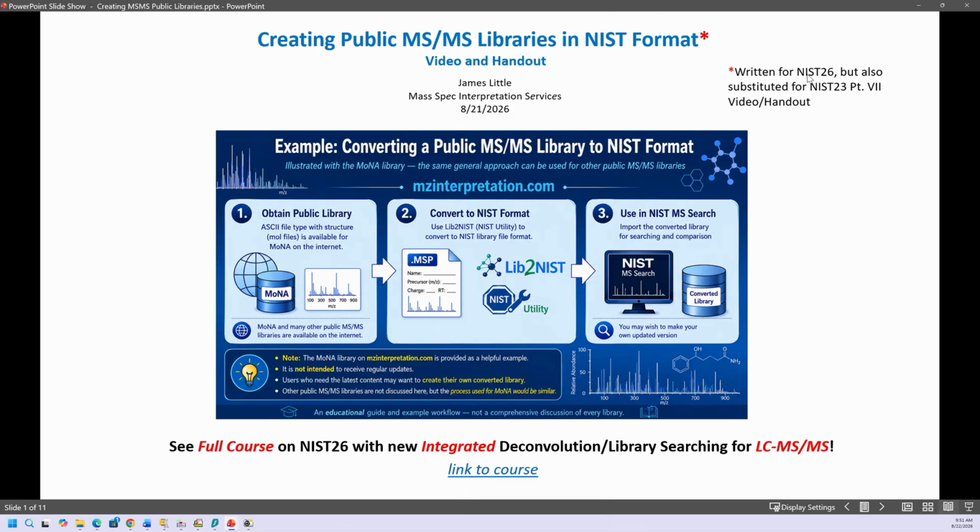This was written for NIST 26, but I will also be substituting it for the NIST 23 Part 7 video handout that I had previously on my website.